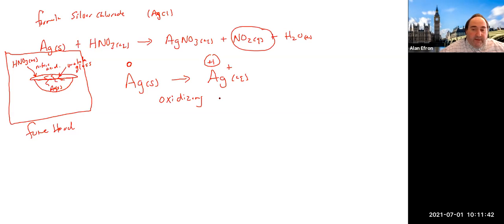And you may be wondering, why is it important to do that? Well, what we're starting with is the silver. At some point we need to add some chlorine or chloride to it. So we need to get the silver into a form where it's able to accept the Cl coming in. In the form of solid silver, it can't really do that.